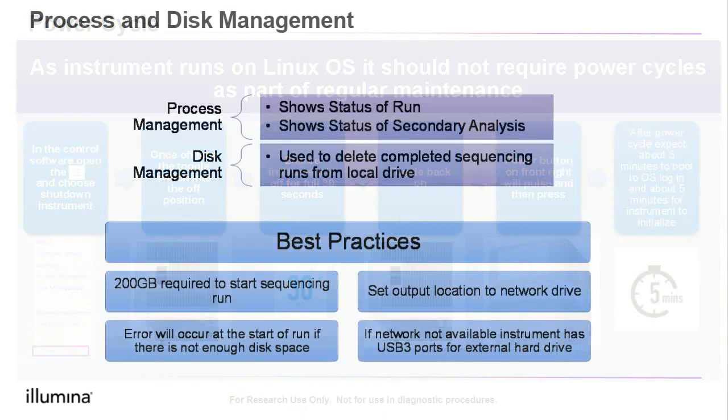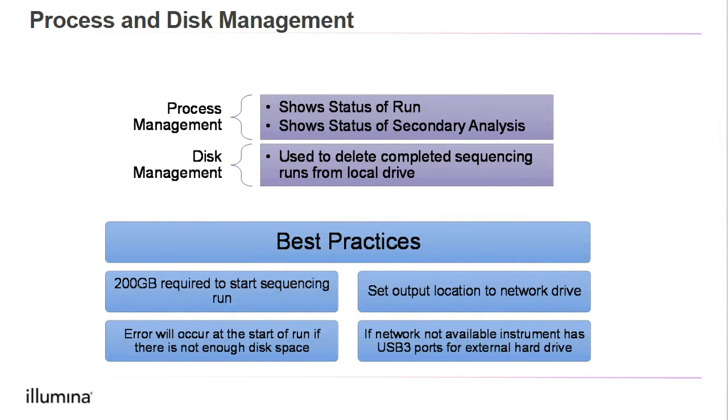There are a couple different management options on the instrument. Process management shows us the status of the run as well as the status of secondary analysis. The disk management is supposed to be used to delete completed sequencing runs from the local drive.